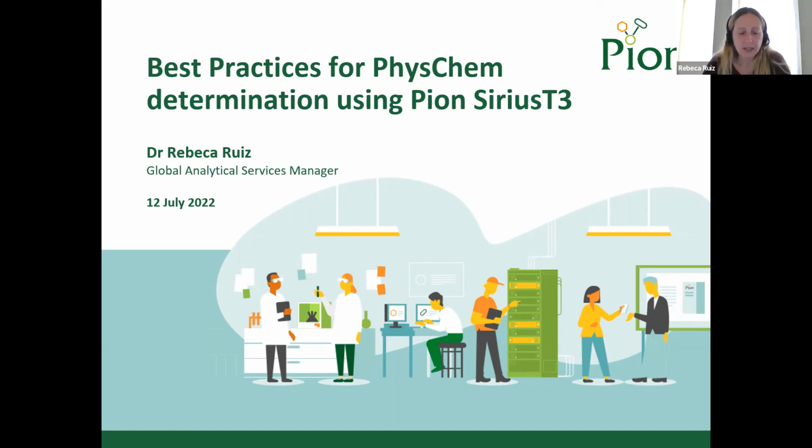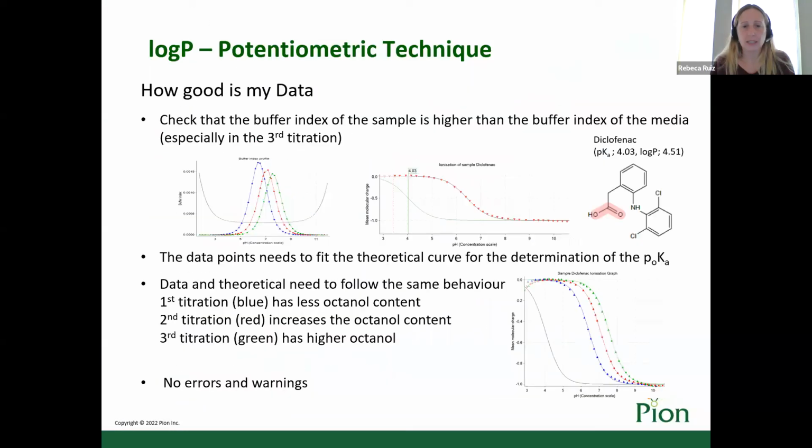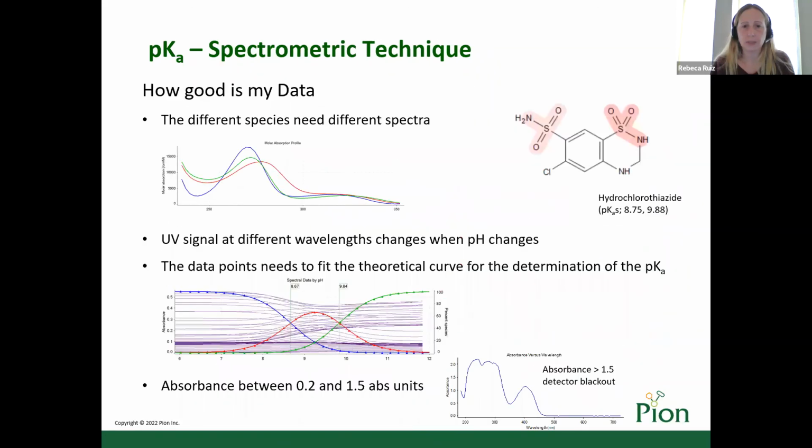Okay, this has different yes and no. You can use the data if there is a part of your signal that is not saturated. Let me show that, because in the graph that I show this, where is that? This has to be here. Yeah, okay. For example, in this case, we have that here the signal is saturated. However, here it is not saturated because it's lower than 1.5.